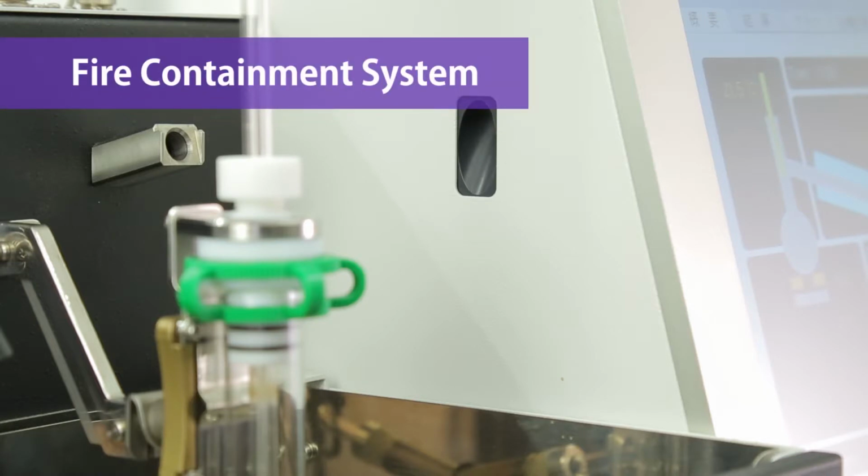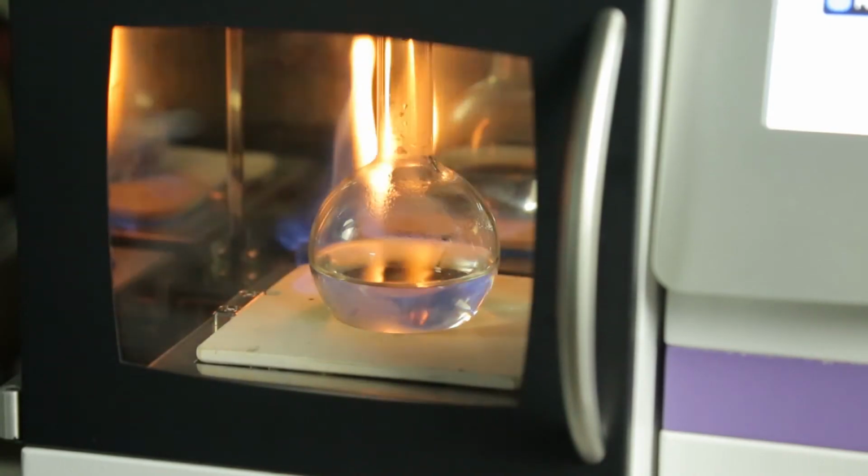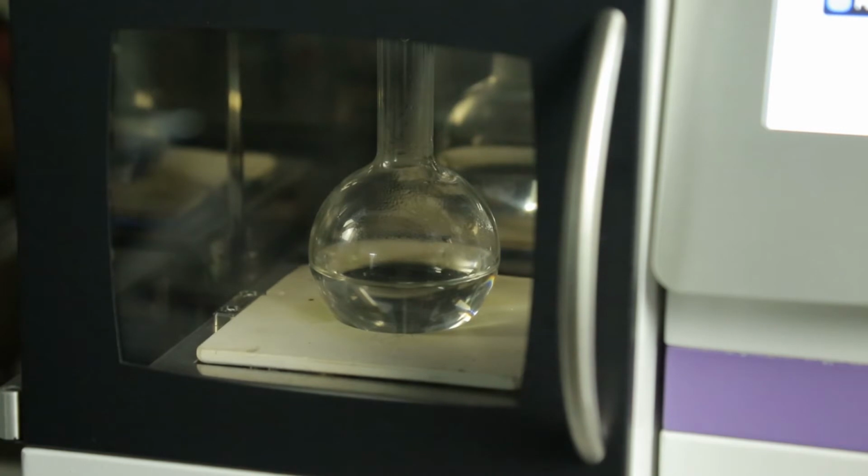In case of a fire breakout around the distillation flask, the ultraviolet sensor will detect the flame and automatically spray carbon dioxide gas to extinguish the fire.